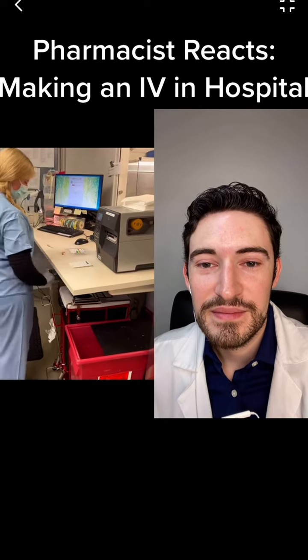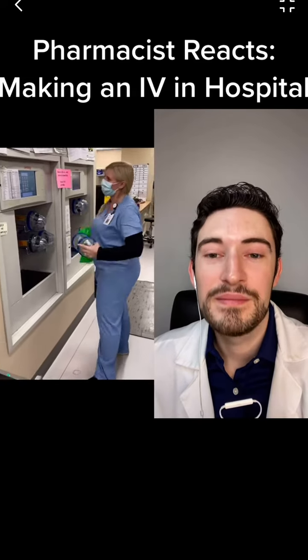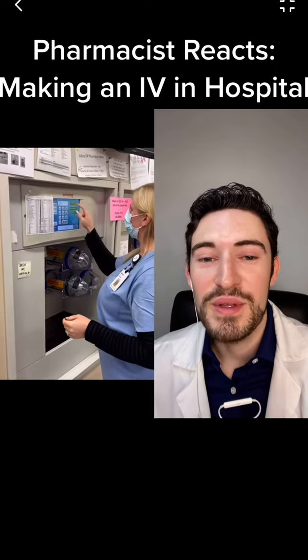She's going to sign off. And in this case, she's going to put it in a light protectant bag before sending it up to the floor. And it's going to go in our tube system. And look how cool that is. Shoop!